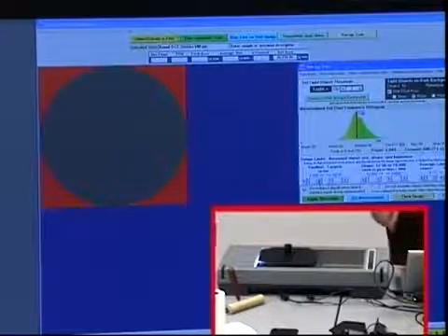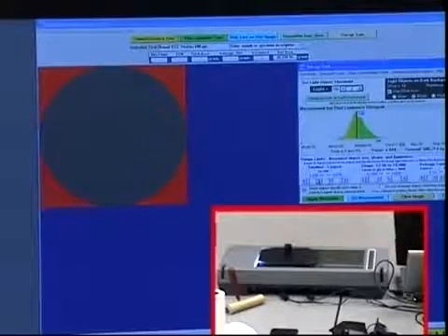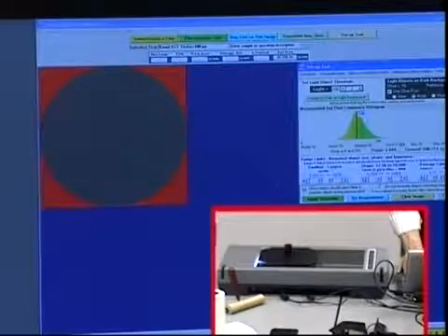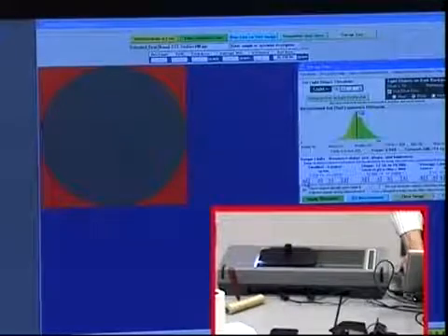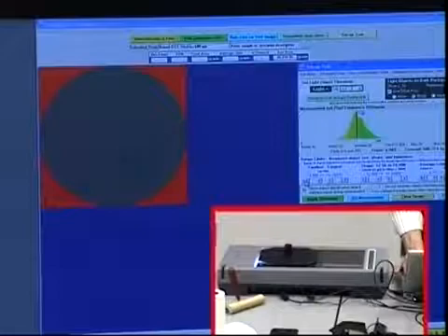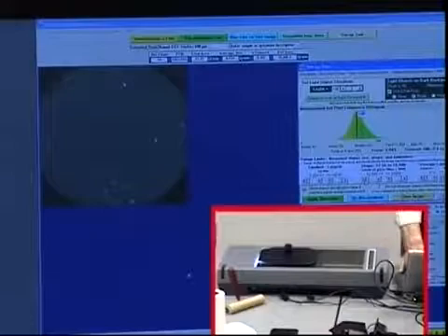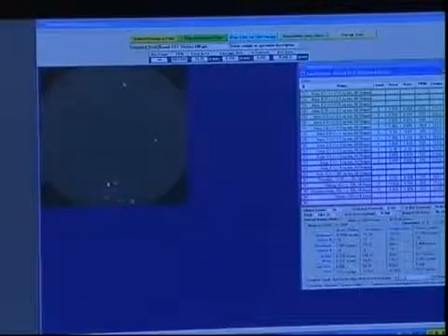Now these stickies are generally very large. Small anomalies we're not interested in. If they're very small specks, we'll limit our investigation to objects that are greater than 2.25 square millimeters. Yeah, good. We'll do the measurement, we'll test it out. And it's all done. Now you see there the stickies, the quantified stickies. A very simple test.